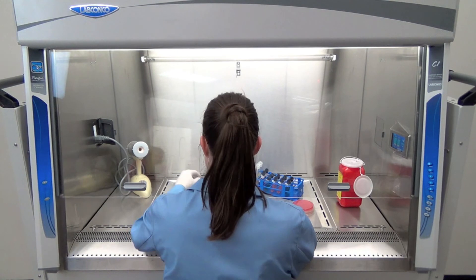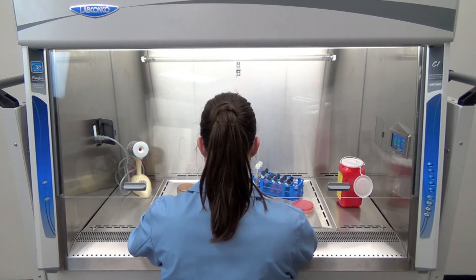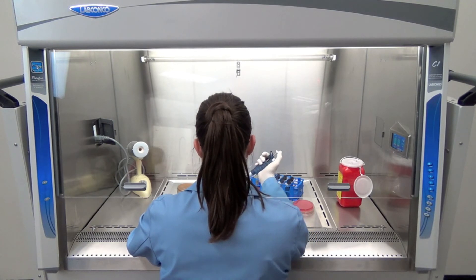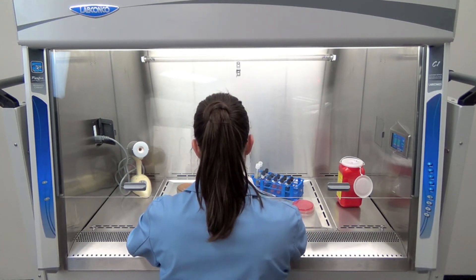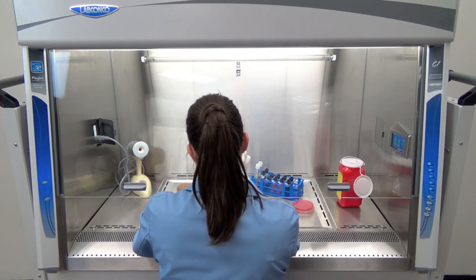LabConco created inclination technology to support humans in their work in an already dangerous environment. By maintaining workflow direction and work zone cleanliness, the Purifier Axiom's ChemZone continues this legacy in the biosafety cabinet of tomorrow.